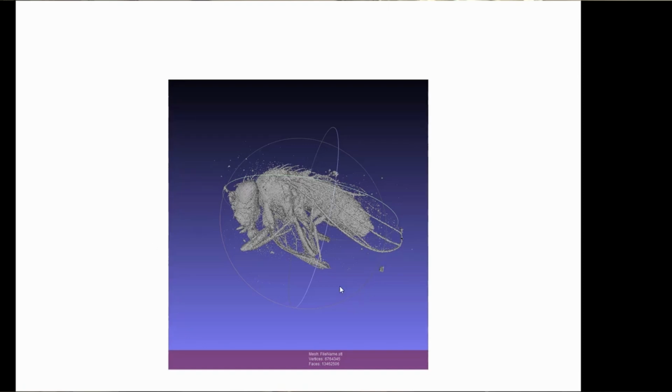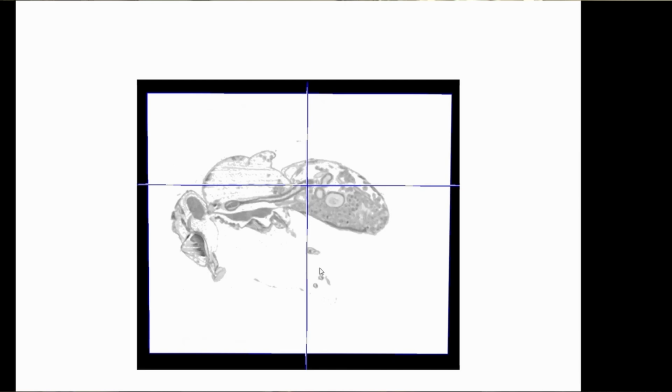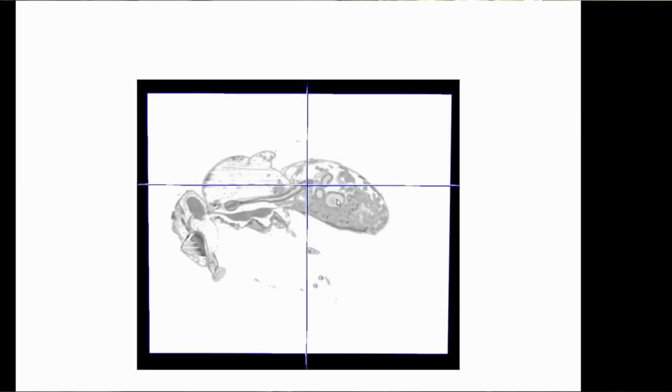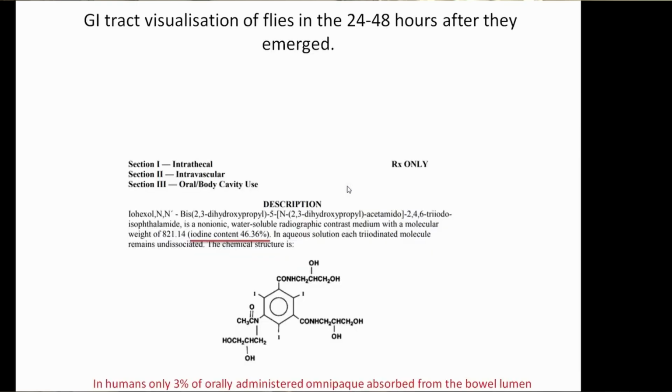It's perfectly good for getting an STL file of the type that we showed earlier. It's also quite good for looking at the internal structure. So one can not only look at external meshing, one can look at individual tissues which have different dielectric constants. So that's a little bit about Lugol's iodine.